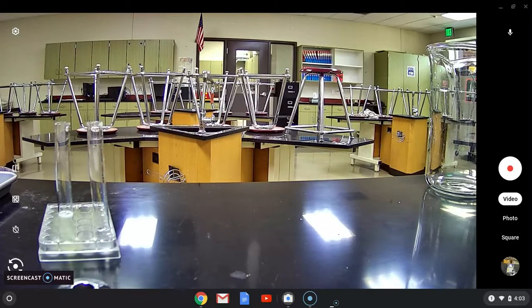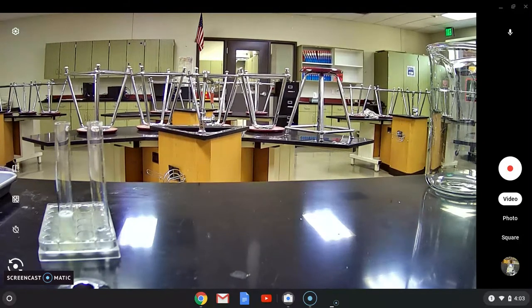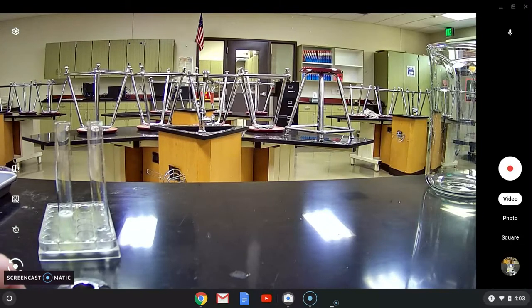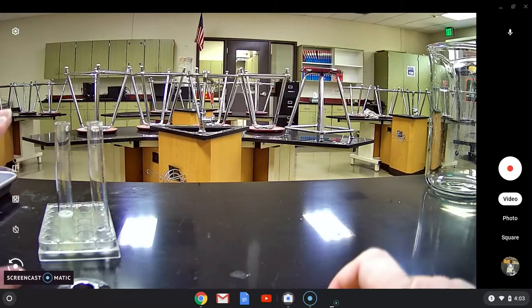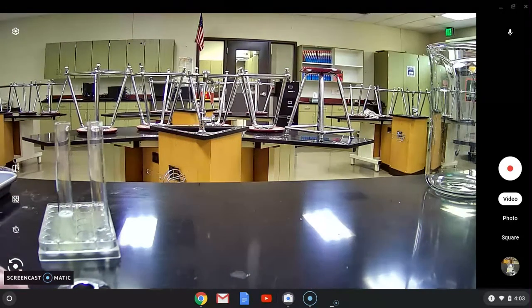Hello ladies and gentlemen. This is yet another installment of biochem macromolecules in foods control group experiments.